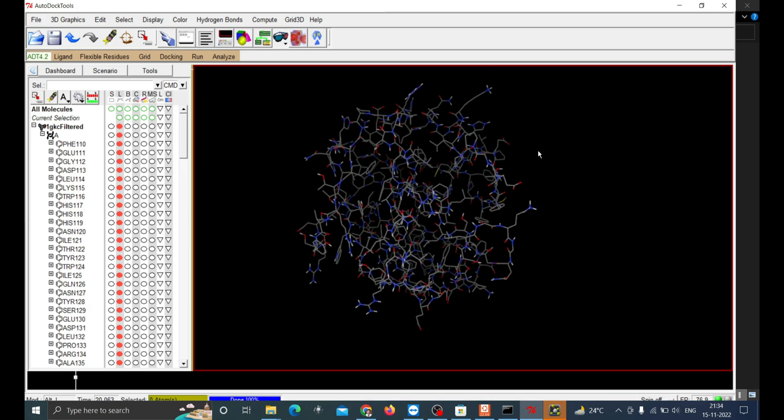Next task is to make the grid box. This is to set the boundary of the docking. If you don't know the active sites of the protein and would like to search all available surface, the grid box should cover the whole macromolecule. Otherwise you can just find the active sites of your protein of interest using this tool called CASTp.